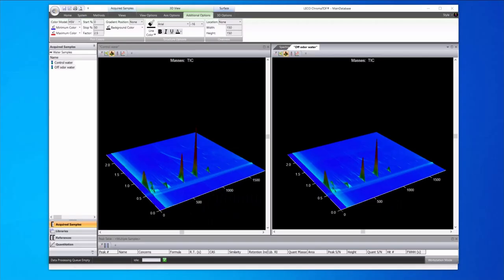We analyzed both of these samples by GCGC with the Pegasus BTX. Our goal here was to look for analytes that might be related to this off odor.